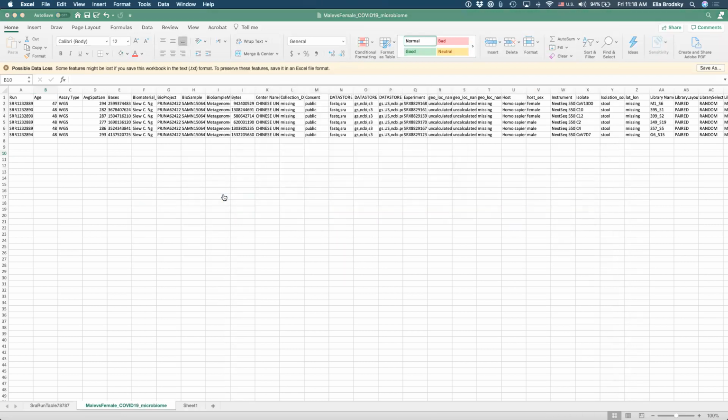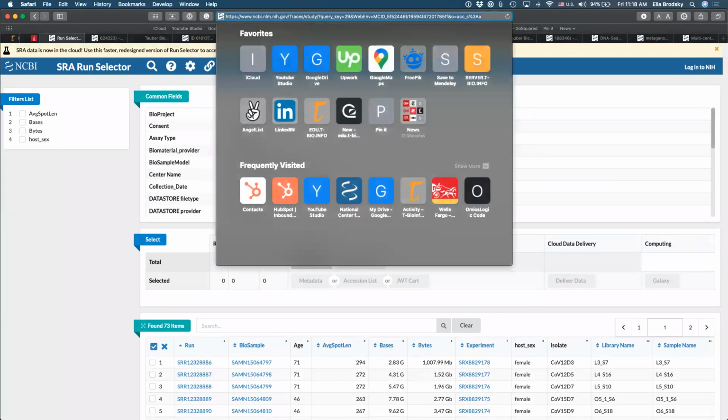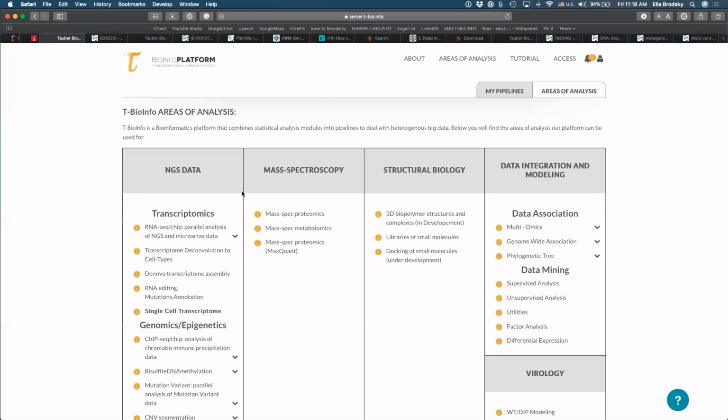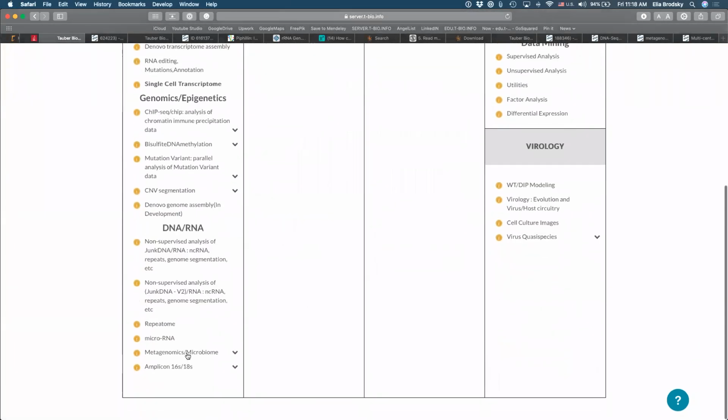And now let's build the pipeline together. Okay, so please go with me to server.t-bio.info. Please let me know once you're here.